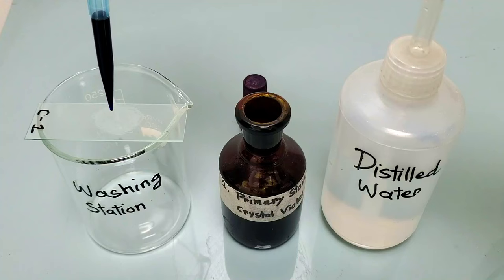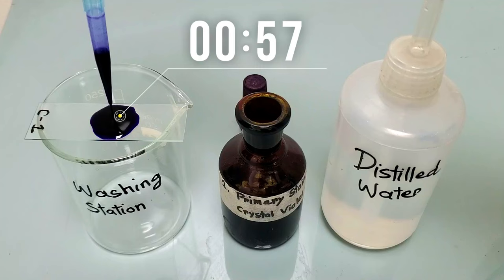Add a few drops of primary stain on the prepared glass slide to cover the heat-fixed smear completely. Wait for 1 minute.